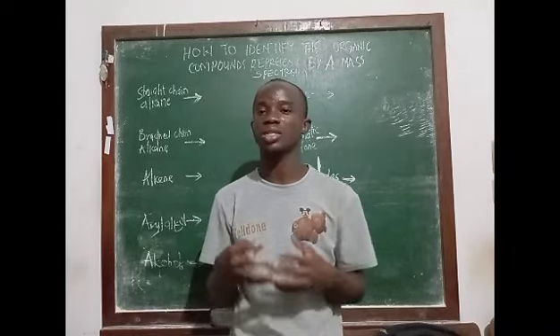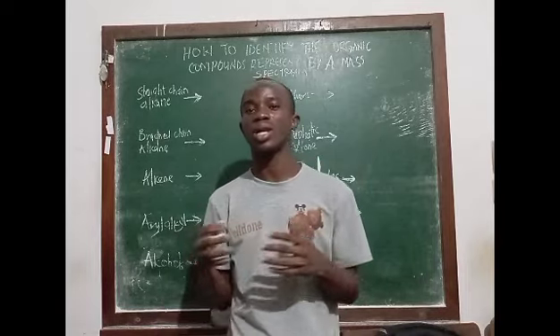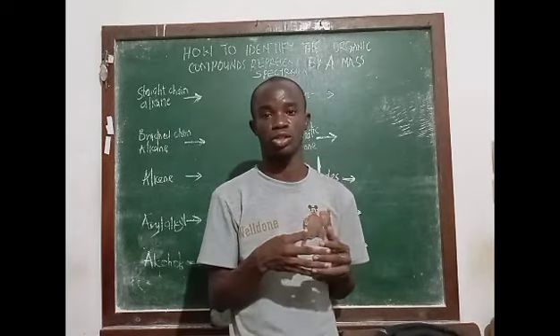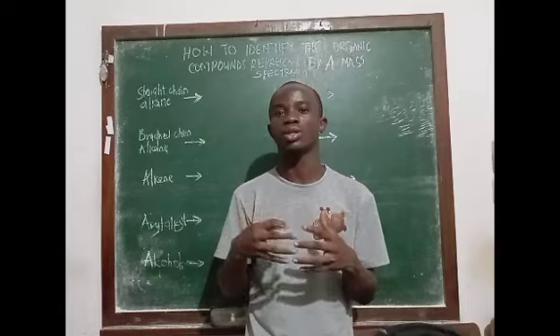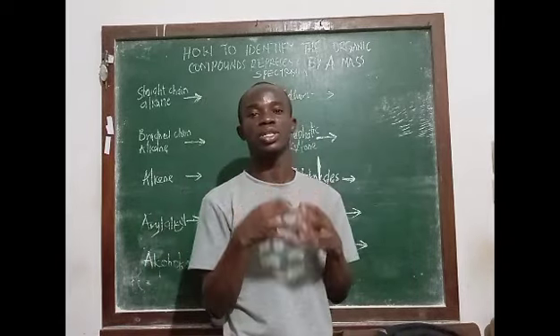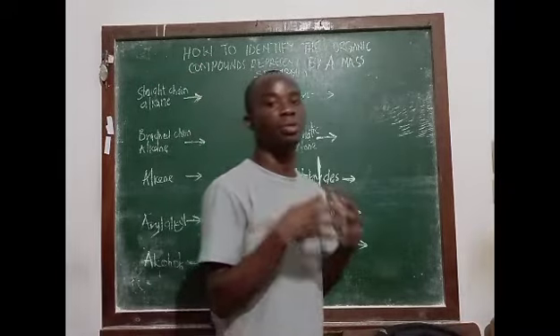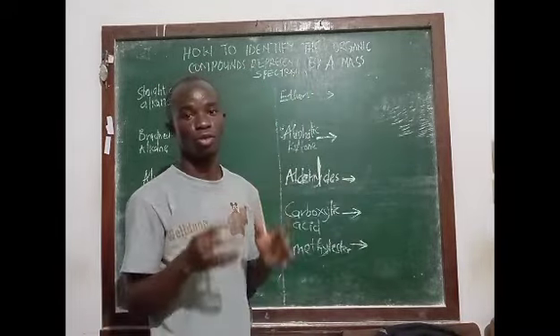There are other signals that you also see in a mass spectrum, but these key points are things that you can easily see that will help you know that the mass spectrum given to you represents a particular class of compound.